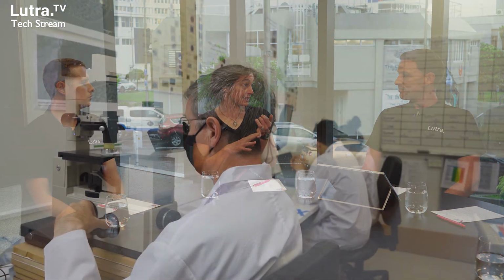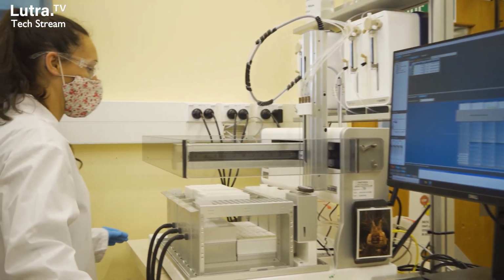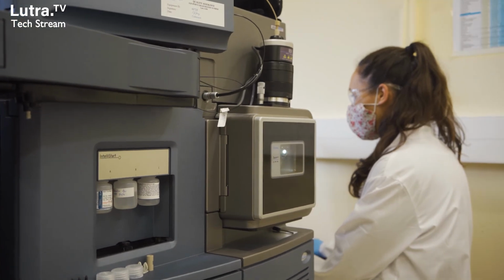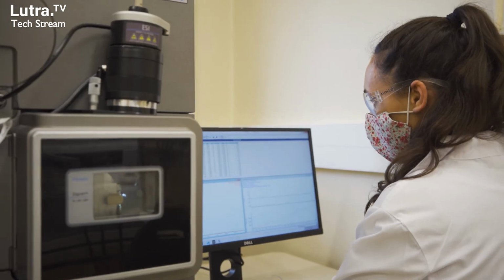One of them was around sampling and testing. We've spoken a lot about spot testing, and about taking grab samples and sending them off to your lab. Are there any other types of testing that Cawthron do that we should know about? The three main ones really are the microscopy testing, so that's the visual assessment, then the gene test to see whether there are potentially toxic ones in the sample, and then the third one, importantly, is the actual toxin testing. That's done using high-tech machines that allow us to detect whether there are toxins in the sample, and to measure them very accurately.